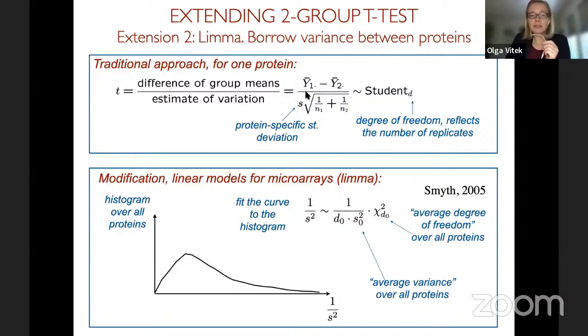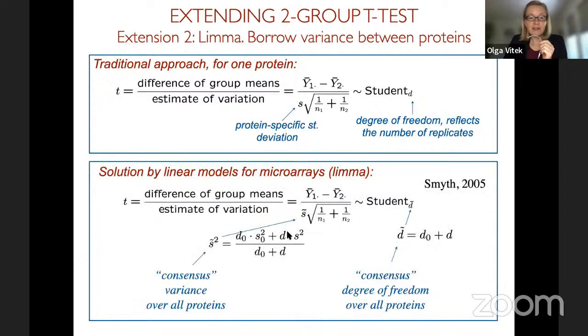And so what MStats is doing is using the same ideas of stabilizing the variance denominator, but it models the signal separately, specifically to the needs of quantitative proteomic experiments. And because the whole point is to improve the stability of the variance, if your experiment has a large sample size, this type of approach, called empirical Bayes moderation, makes no difference anymore, because your protein-specific variance will dominate, and there is almost no difference between the two approaches.